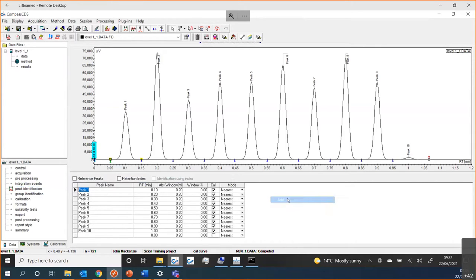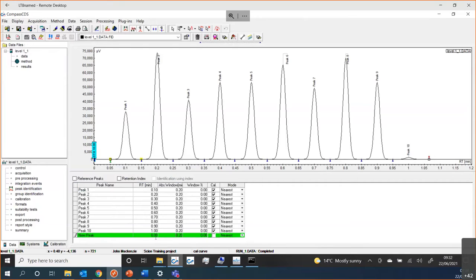I'm allowed to add peaks. I can give it what the peak name is and give it what the retention time is — 1.1 minutes. I can also select whether this peak will be calibrated as part of my calibration curve, or maybe it's just a peak that I measure in some other way where I don't actually use a calibration. So you can select which peaks are going to be calibrated and which peaks are not.